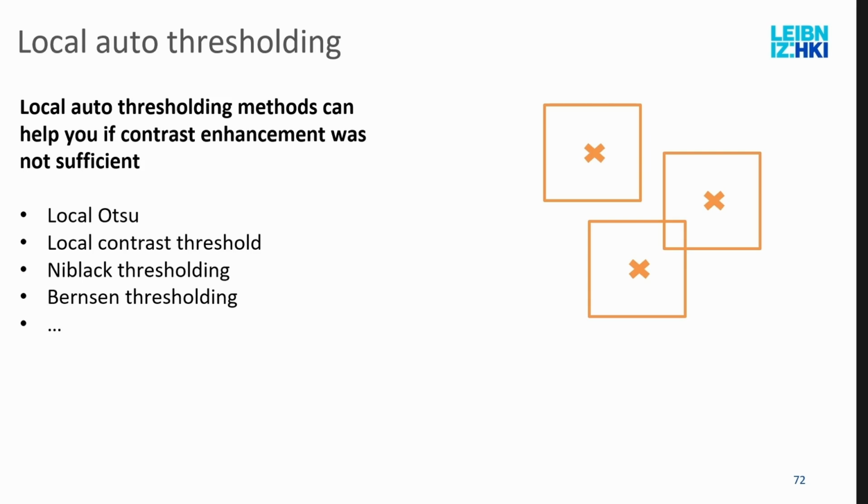These are the two that are implemented in ImageJ and in JIPipe as well, that do some additional checks to prevent your dark regions being exploded, so your noise getting thresholded as wrong signal. And I would try them out if you have an image that is a bit varying in strength and you could not really correct it with other means.